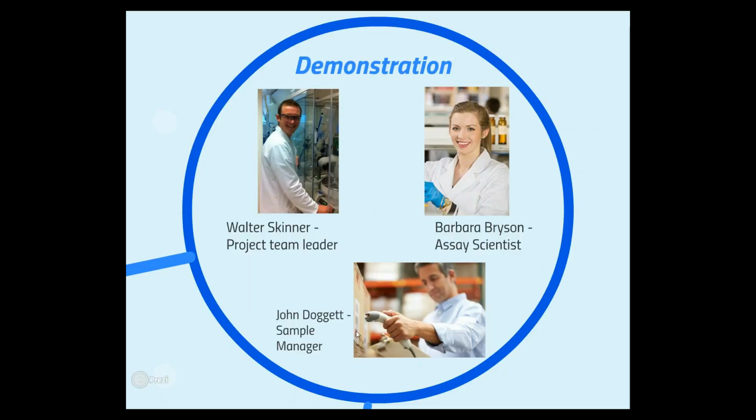And then John Doggett is a sample manager who works in the sample management group. He's going to be receiving powder samples from the offshore powder store and then processing those into assay-ready plates, ready for delivery to the assay lab. So this workflow involves 3 different people. Hopefully you can follow it as I run through the demonstration. Just try and keep track of the fact that I'm changing roles as I go.